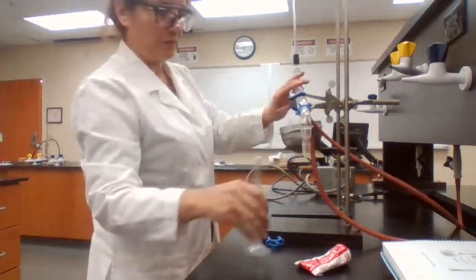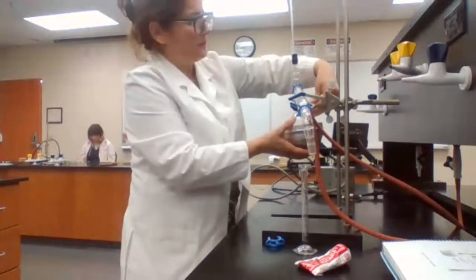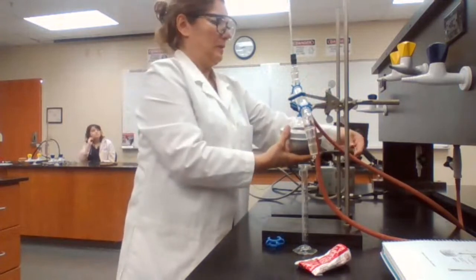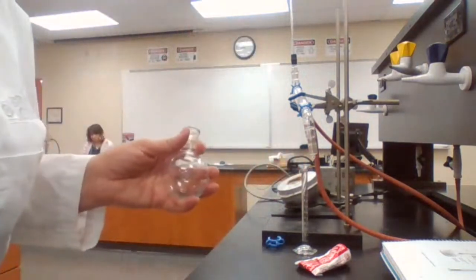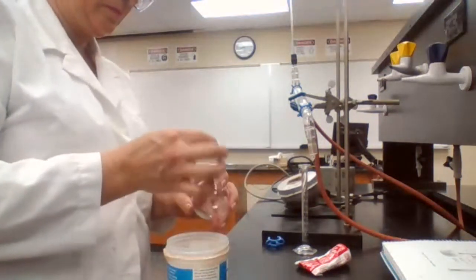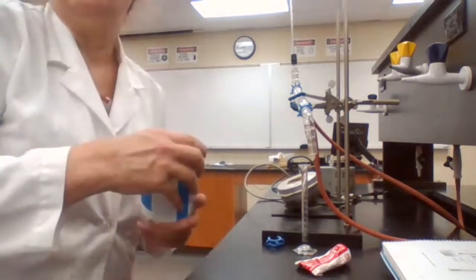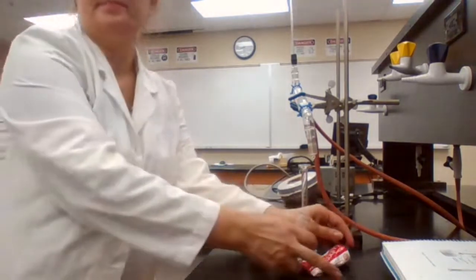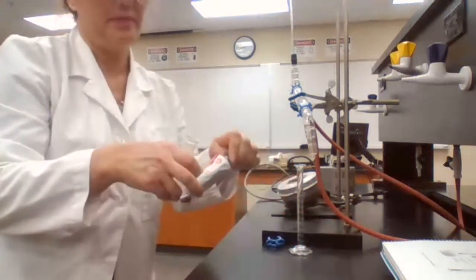Okay, I'm going to detach the flask so I can get the chemicals in. And place 2-3 boiling chips in. So what's the purpose of using boiling chips? To a smooth boiling, very good. So it would prevent bumping.